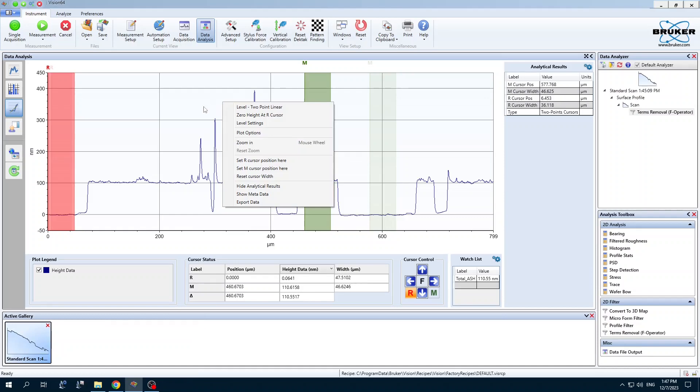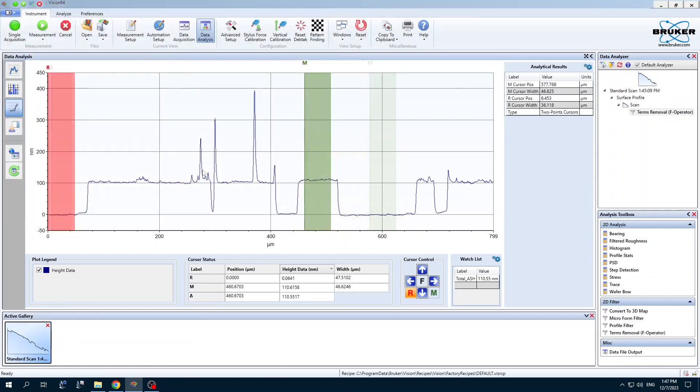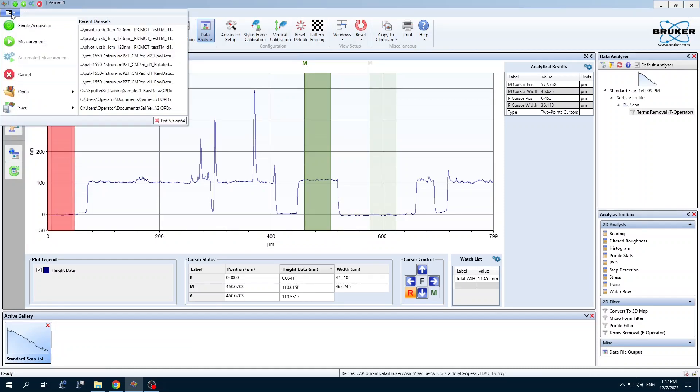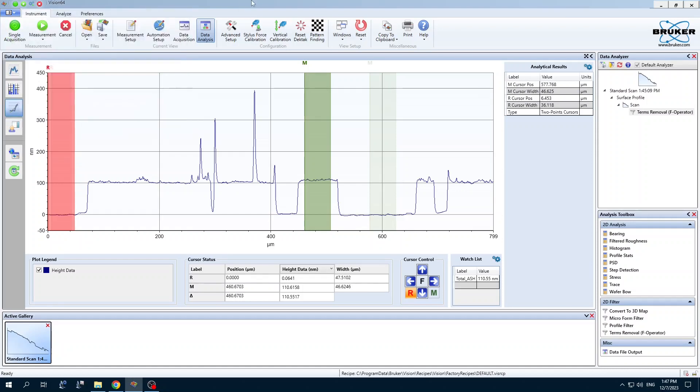You can export this data in a few different ways. Right click, export data, will give you a CSV file. You can also save, I think it's an OPDX file, and you can open that in some other software like Gwiddy and do extra analysis there.